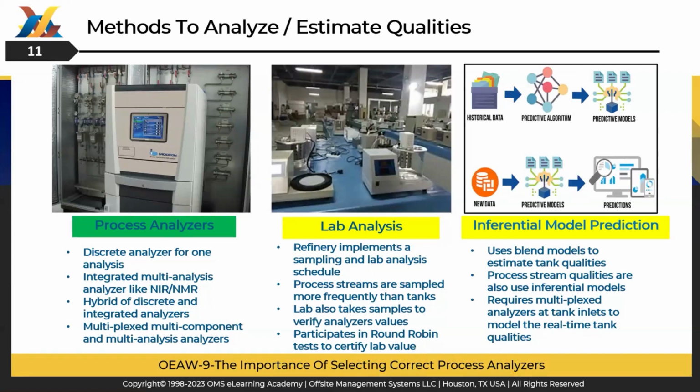Lab analysis is a must all the time. They always do it to check the values of the process analyzers and also to give feedback to the inferential model prediction. So these are the 3 methods. We'll focus on process analyzers in this webinar.